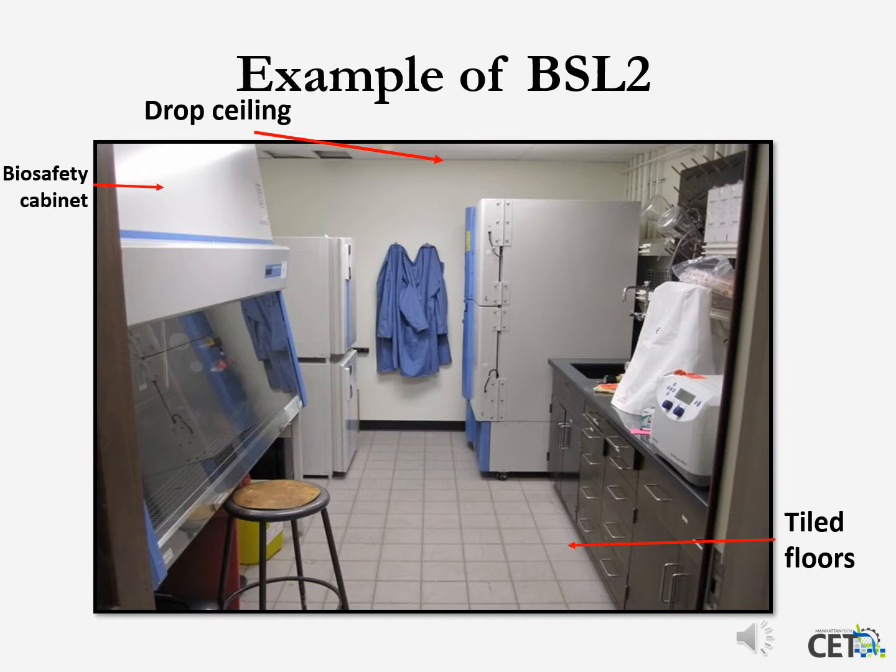There is an area over here on the left of this picture. It's called a biosafety cabinet. It keeps the materials from being aerosolized out into the room. It's away from the doorway. And there is an autoclave available.